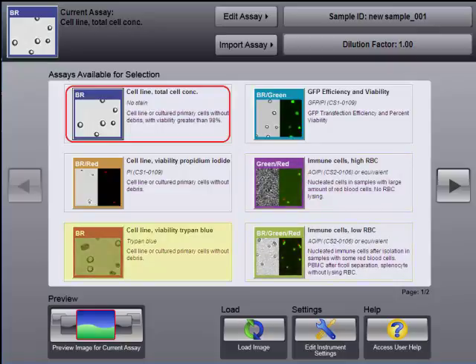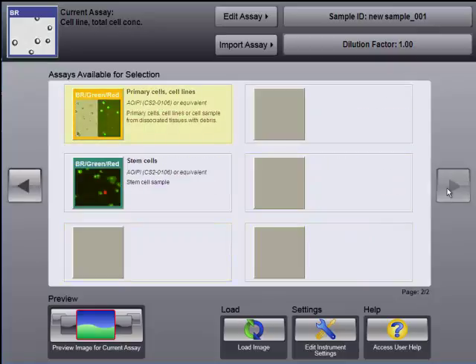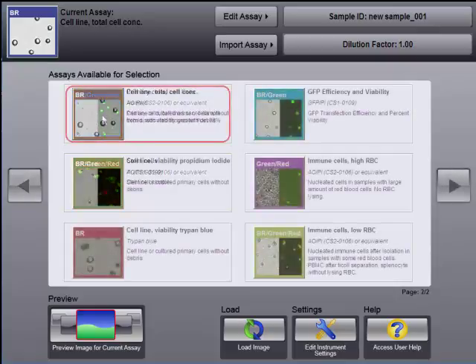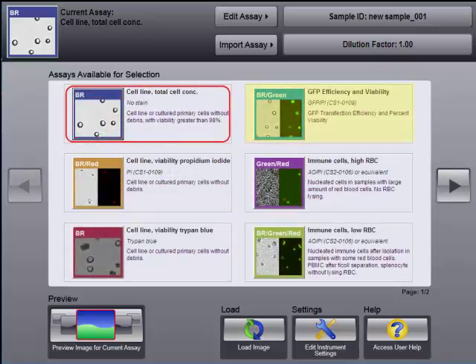splenocytes, cell lines, tumor cell suspensions, stem cells, and other primary cells. Users can also determine GFP transfection efficiency and viability.